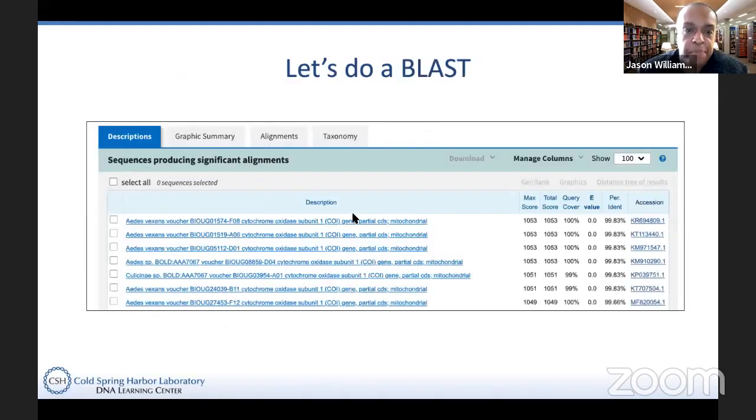Okay, so we've done the BLAST, and let's go back and take a look at what it looks like.